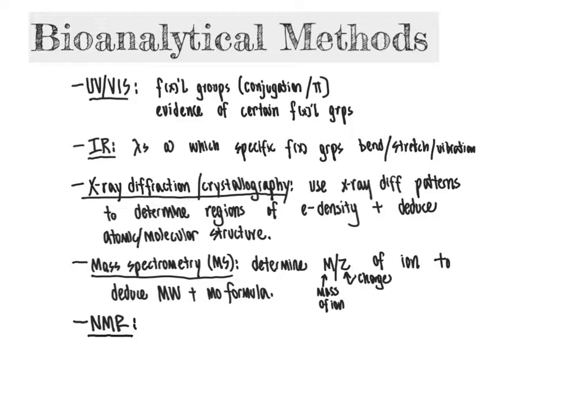In nuclear magnetic resonance spectroscopy, what we are going to be doing is evaluating connections between atoms to assemble the full structure.